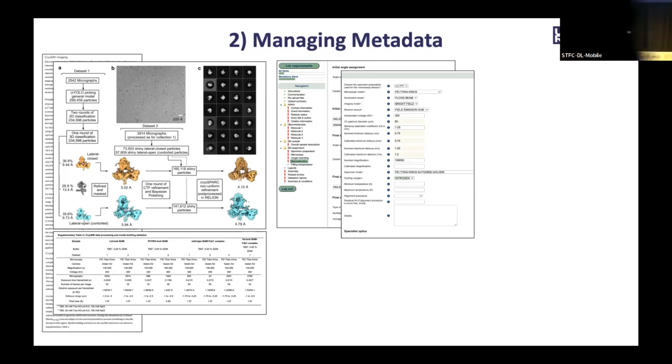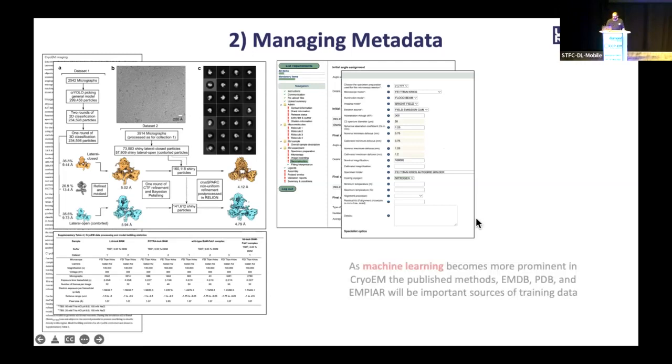And the answer is no. You're never going to know every single parameter used in every single job without actually seeing the actual data processing. And as machine learning, especially, is becoming more and more prominent in cryo-EM, all these published methods and the data in the various databases are going to become really important for building training sets. And we all have an interest in these being as complete and as accurate as possible.